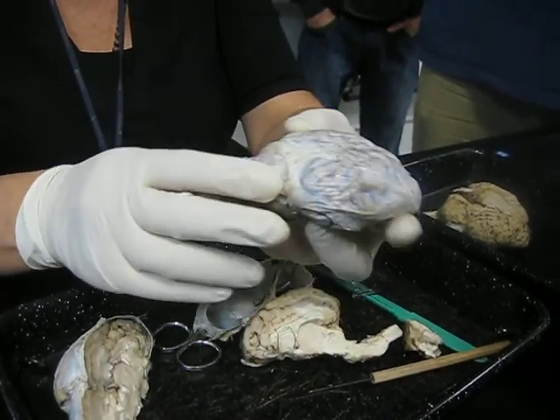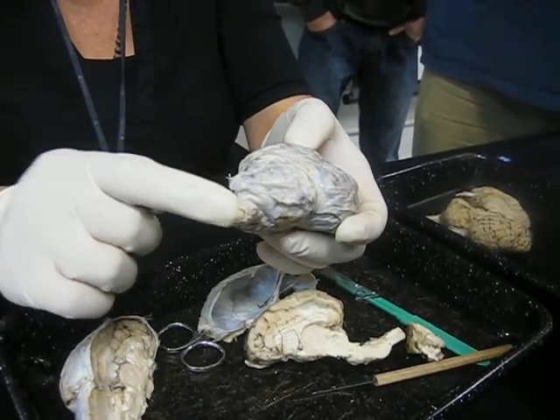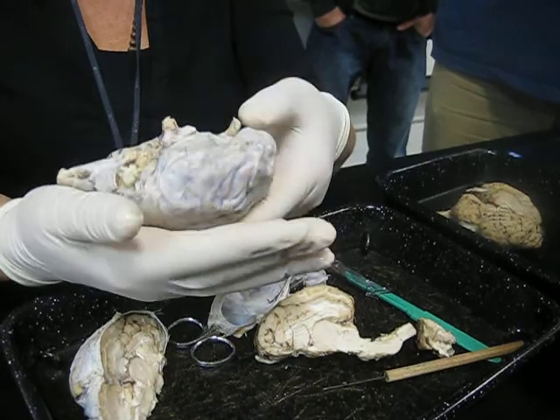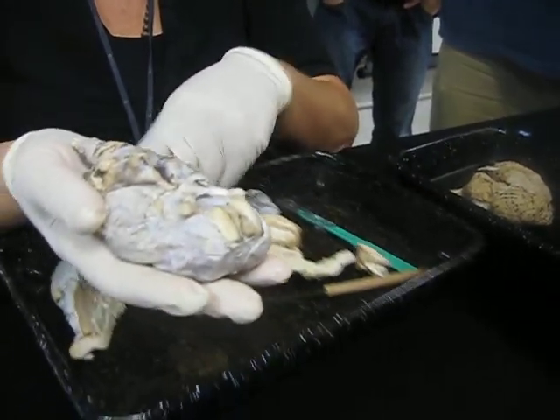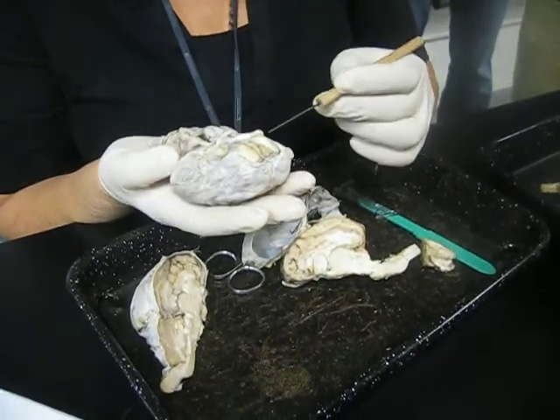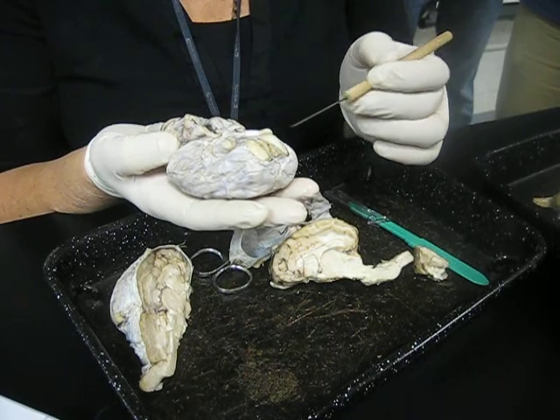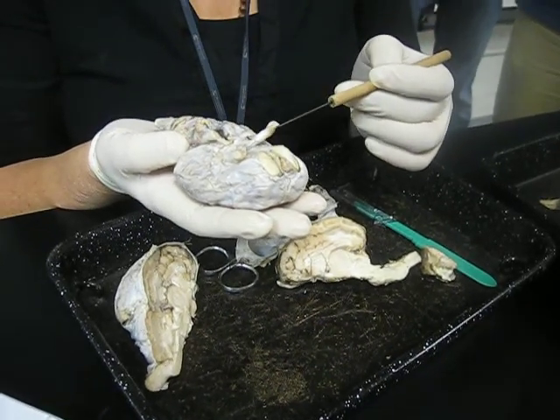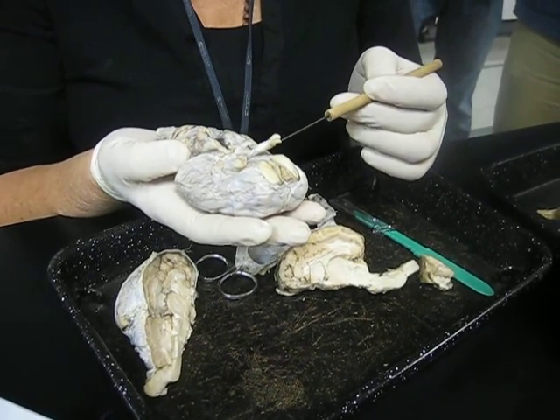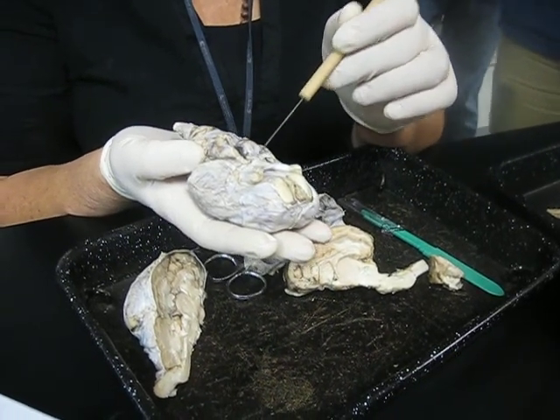Okay. Here, back here, you can see the cerebellum. Down here is the spinal cord. I'm going to flip this over, and I'm going to identify the structures here. Here you see the olfactory bulb. That's the beginning of cranial nerve 1, or the olfactory nerve. Here is cranial nerve 2, or the optic nerve. This is the optic chiasma.